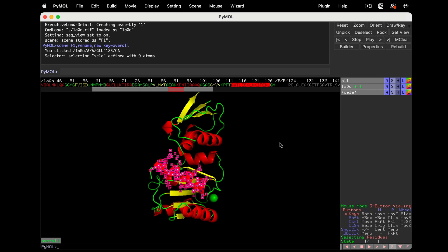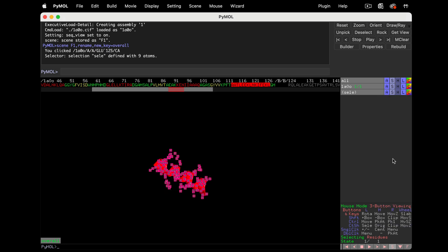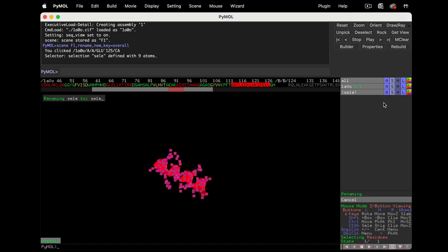Now one of my favorite command combos. SELE, hide unselected. Then rename the selection to helix to save it.